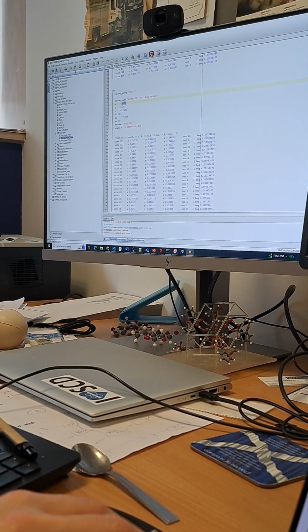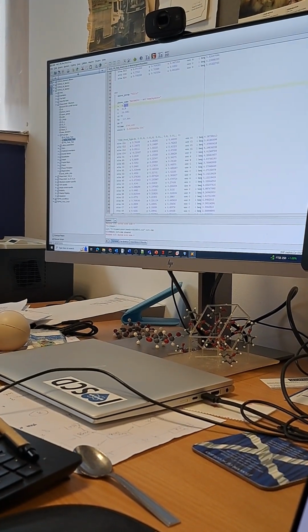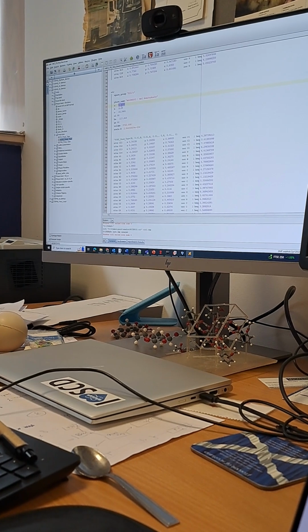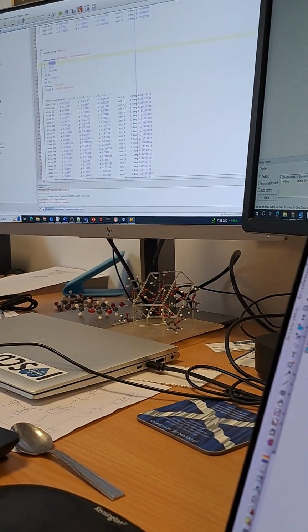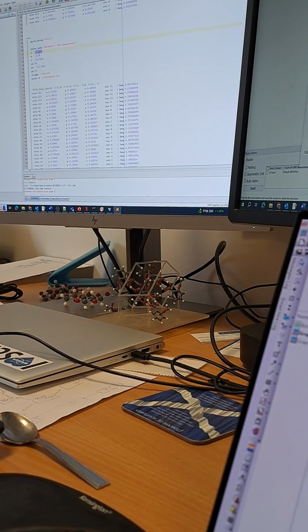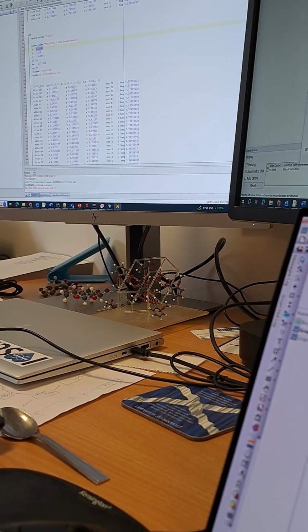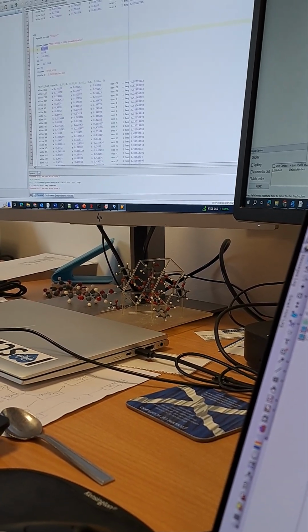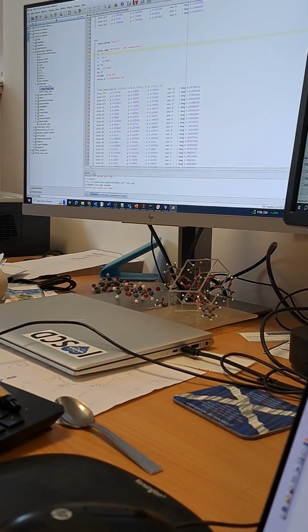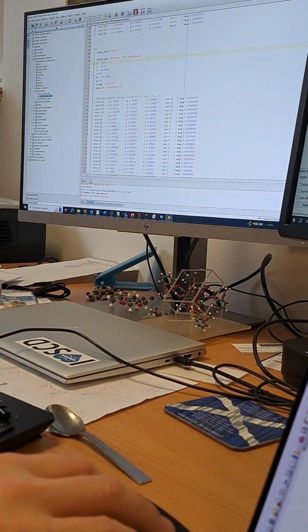We want to move them all to that angle, so where are we going? Up or down? This way up, 8.1. Right, so we're wanting to move 2 theta up this way. So 2 theta goes up, d spacing decreases. Right. So 7.9. Okay, so let's go and put 7.9.